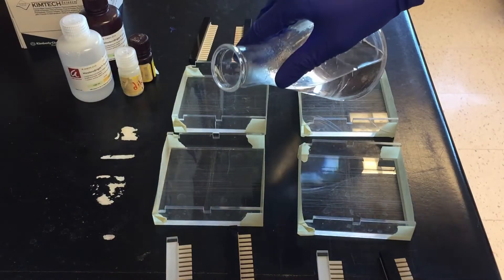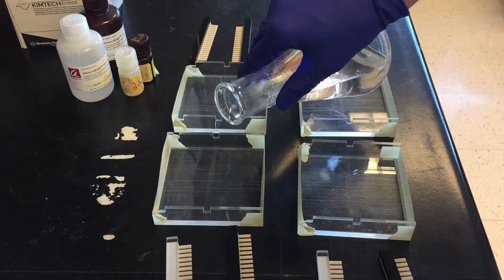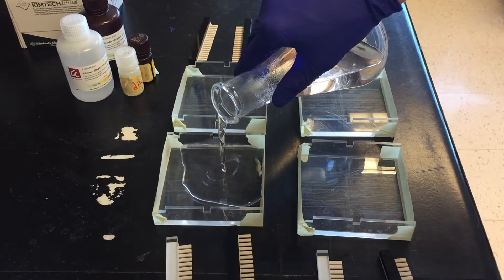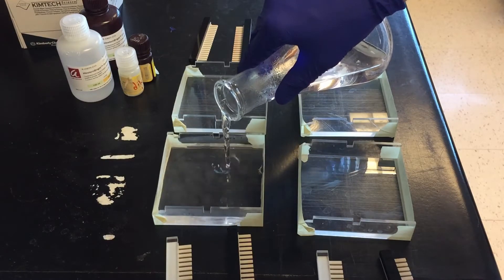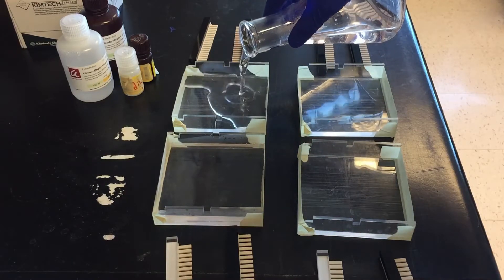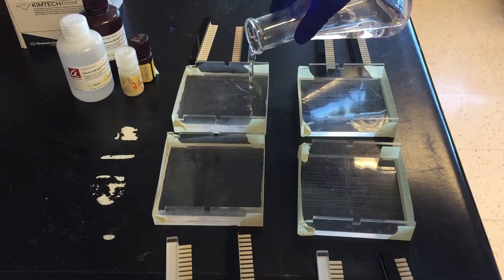Pour the gel after it's cooled enough to touch the side of the flask for a few seconds. You can put the comb in before or after, it's just more important you make sure it's clean. And then let it solidify for about 30 to 45 minutes.